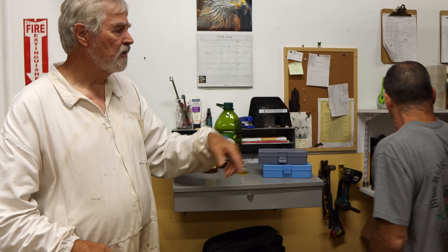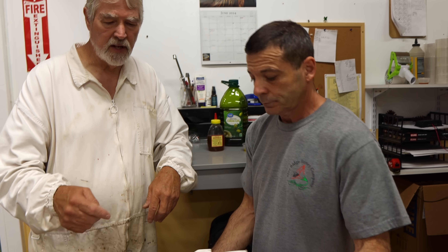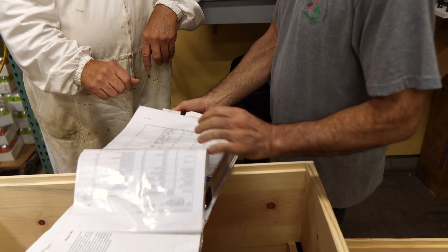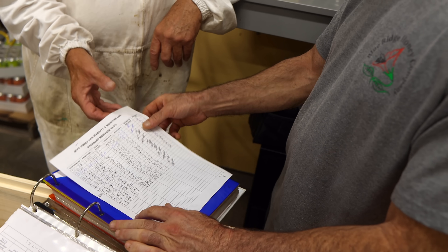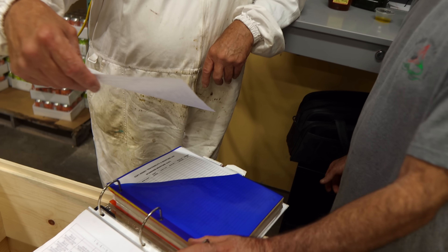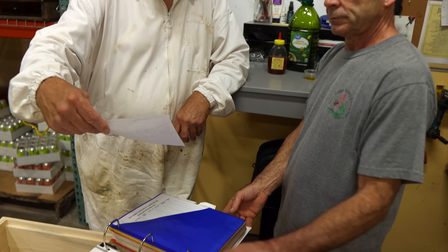Every load of honey that comes in here — all of our honey, every semi-load of honey we purchase — Louie does a test on it. He has a log book, and he has to put down the moisture reading for the inspectors on everything that comes in. Looking at this log, I'm seeing numbers: 17.2, 16.2, 17.8, 16.9, 16.1, 18 — 18 is the highest. So the honey that's been coming in here lately is in really good shape.